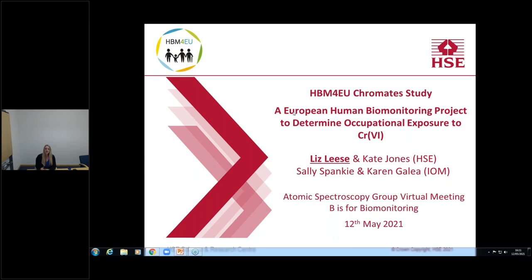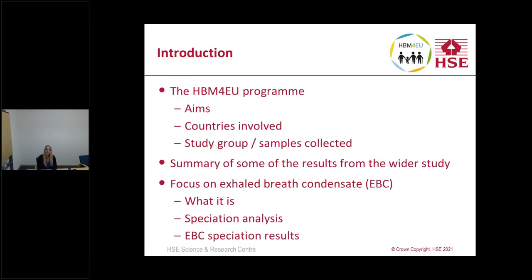So, I'm going to talk about the HBM4EU chromate study, which is a European human biomonitoring project to determine occupational exposure to chromium-6 across Europe. So the HBM4EU project as a whole is quite a large study.